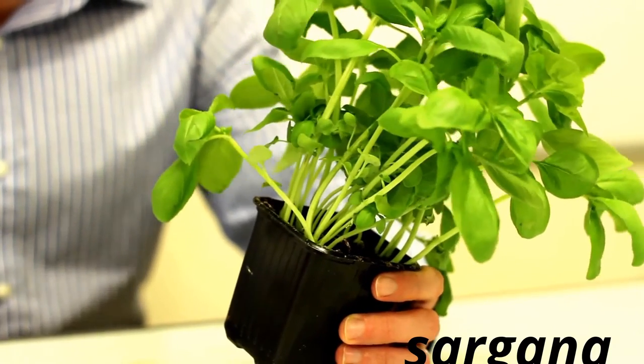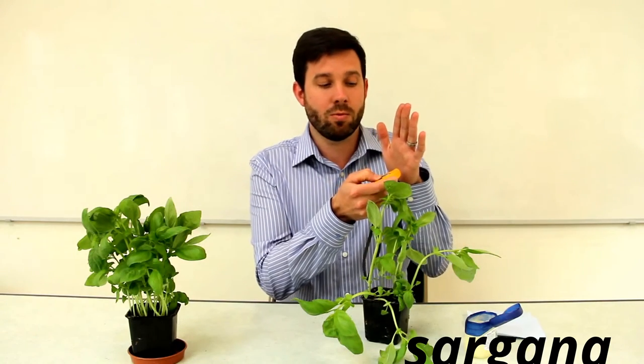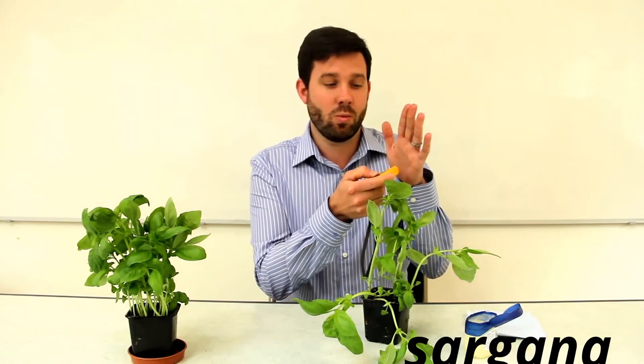The infrared thermometers are about £17 each and you can use them to measure the surface temperature of a surface. My palm, for example, is 30.1 degrees.